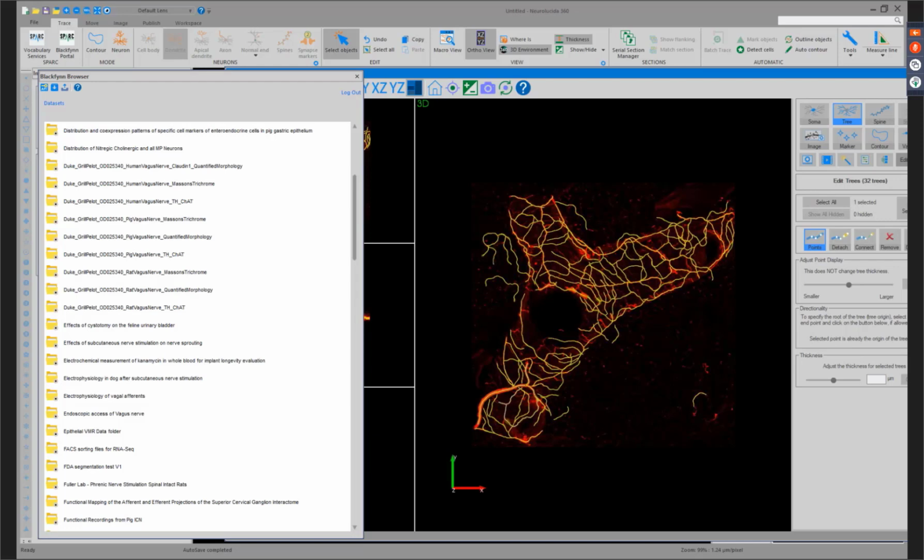And so you could generate contours to label those images. And as you mentioned, they could be used for in silico modeling. So that would be a great way that data generated in the image segmentation side of things can be utilized for simulations and other types of modeling behaviors.